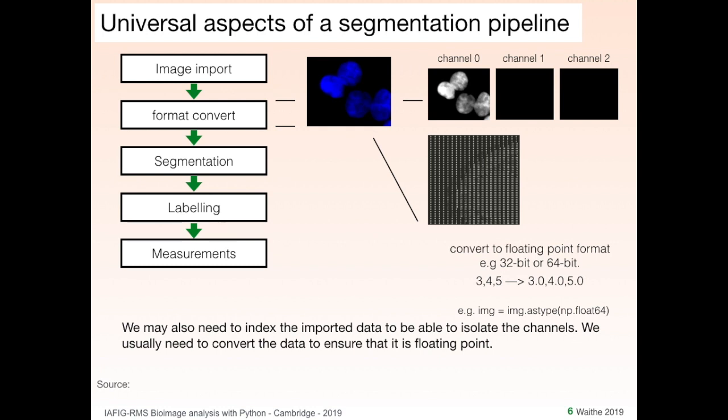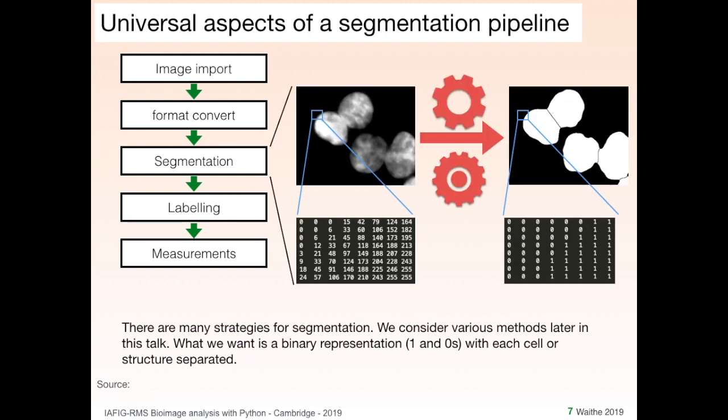And then we have our segmentation. This can vary, as I've told you, but essentially there'll be some kind of algorithmic process which will convert our image from one format and transform it into another space, and may also have some sort of post-processing which helps split the cells or the objects that you're looking at. So this is really the subject of this lecture.